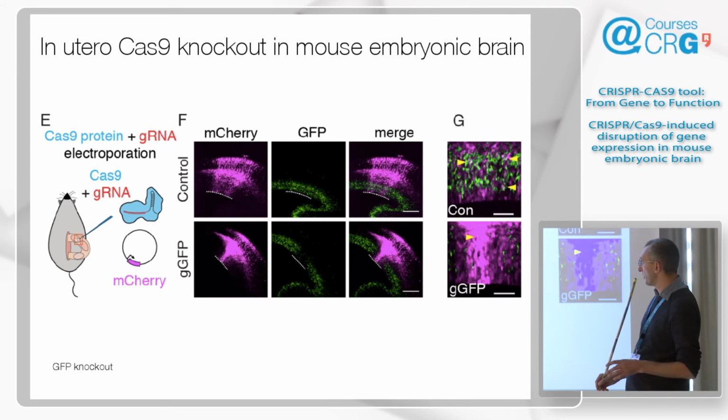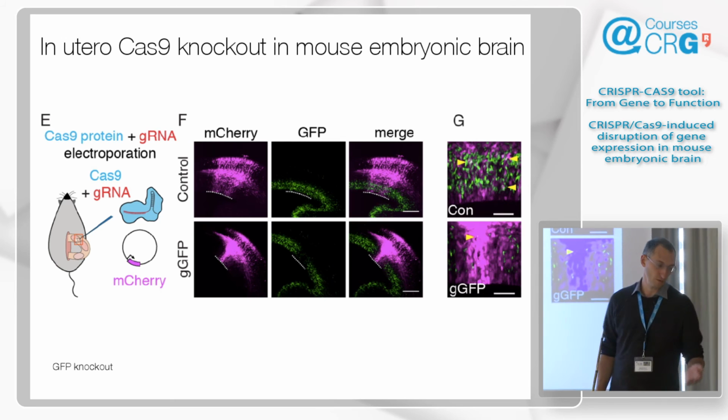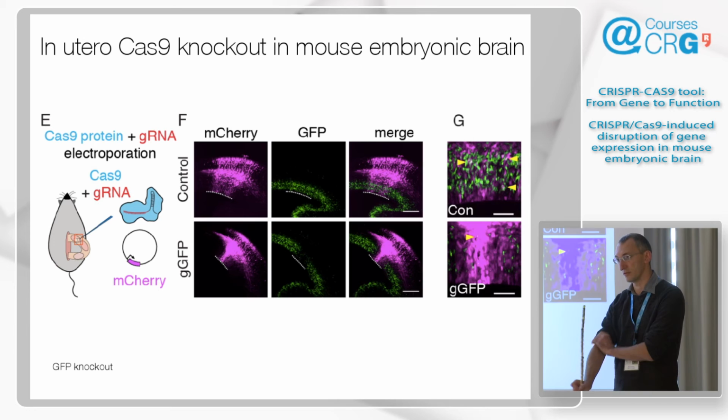Now, in the quantification, there's a caveat here that it's not always the same cell that receives the protein and our reporter plasmid. So in the future, or now, what we're doing is basically using labeled protein instead of co-expression.